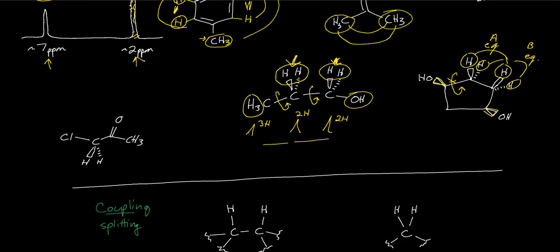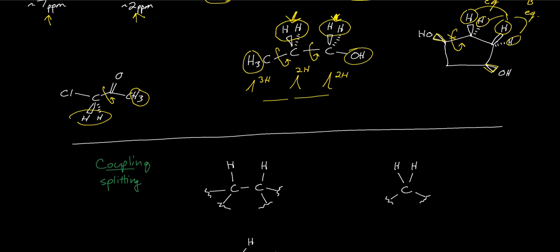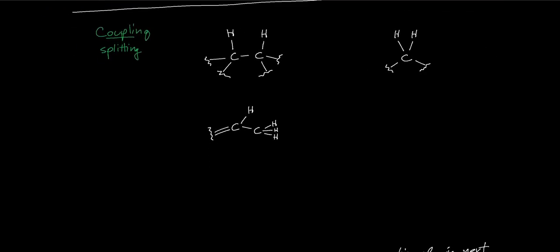We have one more example here. We know our methyl group hydrogens are equivalent to each other. These 2 hydrogens, again, are equivalent because of the free rotation. Whenever you have equivalent groups of hydrogens, remember, they pile up at the same chemical shift in the spectrum, and they would integrate for that number of hydrogens.